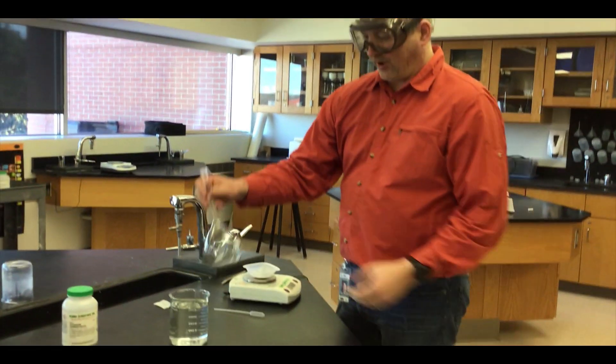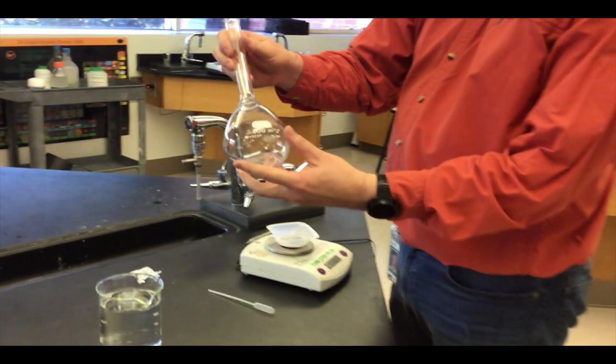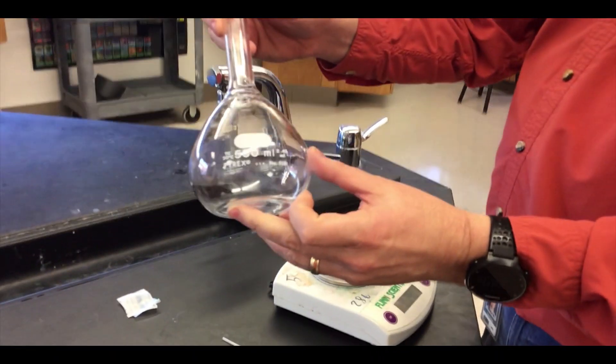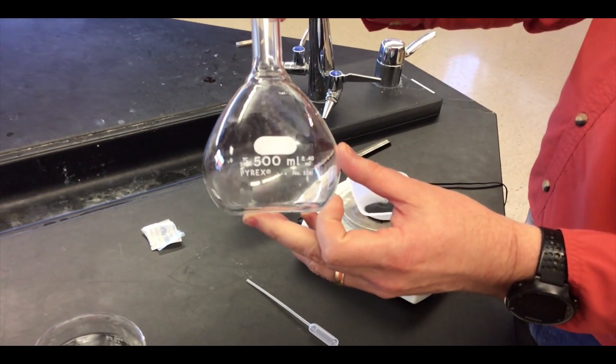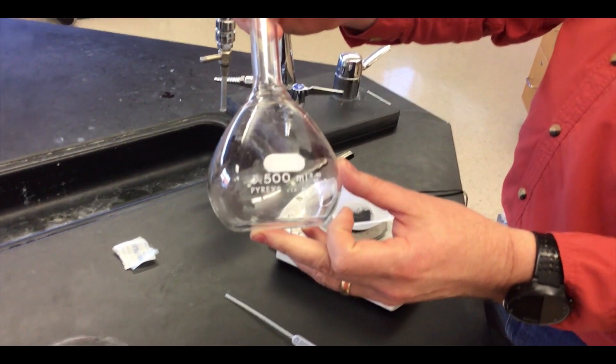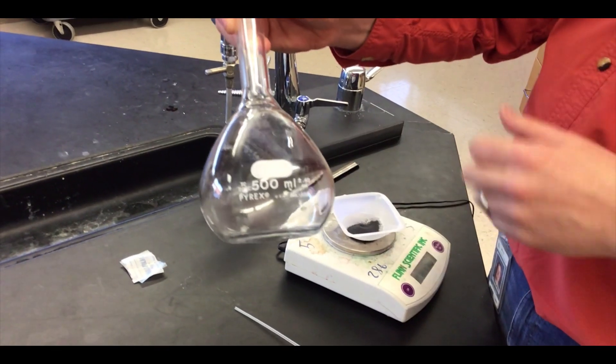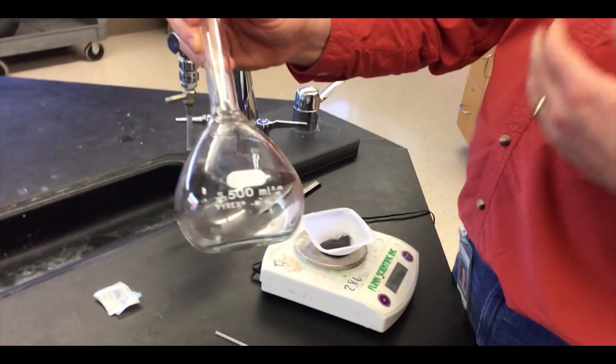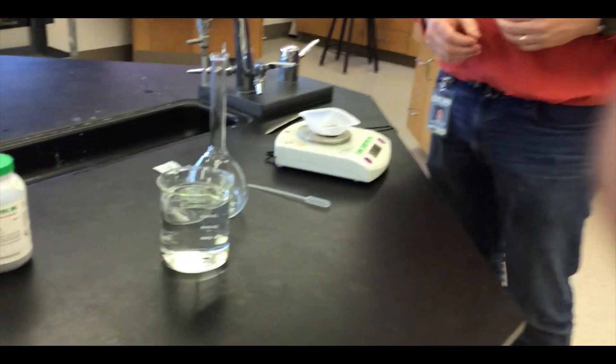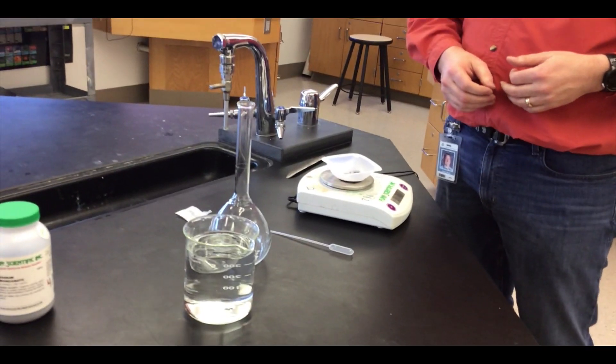I have here a 500 milliliter volumetric flask. For each sample of substance that we would make we would have a different size, so they come in liters, 100 milliliters, 50 milliliters, 500 milliliters. We're going to make a half liter or 500 milliliters of a potassium permanganate solution.